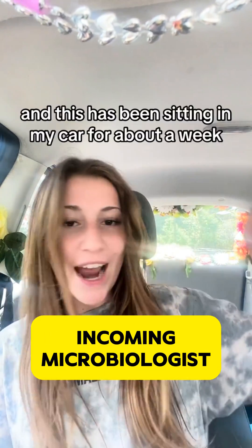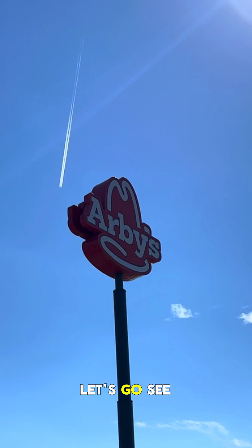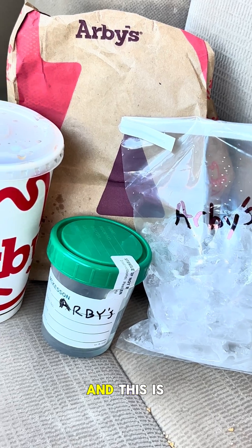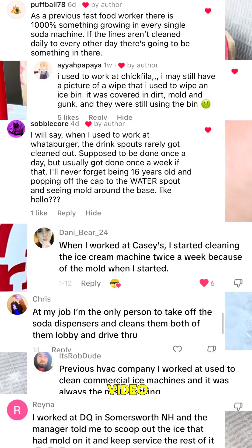I went into an Arby's to get some water and this has been sitting in my car for about a week. I'm currently at my Arby's and let's go see what's growing — this is gonna validate a lot of the horror stories that were shared in the comments of my previous video.